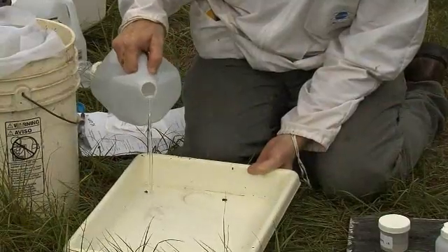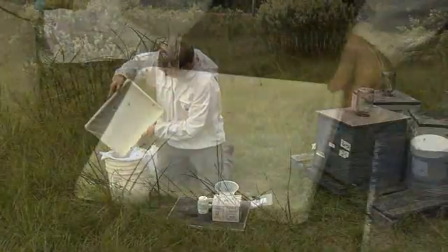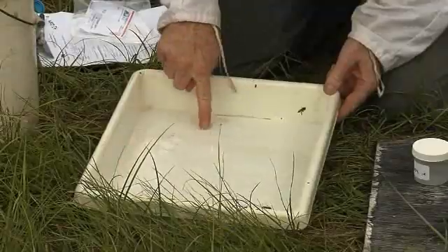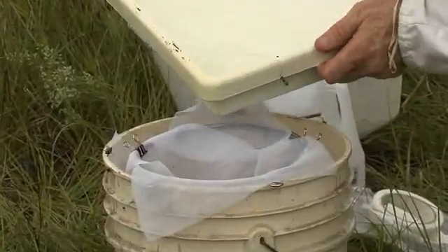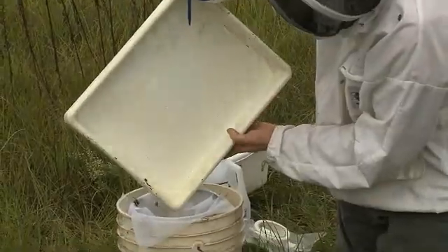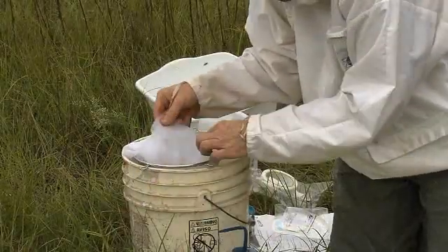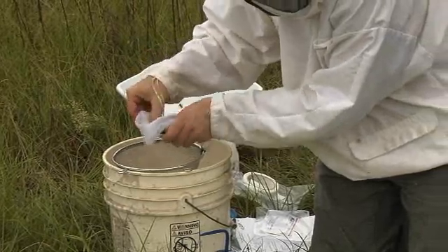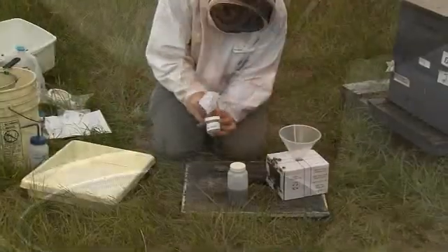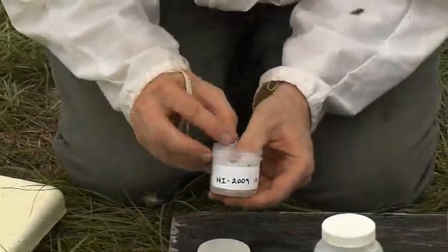Place about two cups of water into the collection pan and gently swirl the contents before pouring the water and debris through the nylon filter. Pour another two cups of water into the collection pan to remove any remaining debris. If necessary, use your finger to gently dislodge anything stuck to the bottom of the pan and pour the contents through the filter. Use the wash bottle to remove any remaining debris and pass it through the nylon filter. Now gently remove the nylon filter from the strainer, folding it so that the filter debris remains secure in the center. This debris will be examined for mites, specifically Tropilaelaps. Gently place the nylon filter into the small bottle containing alcohol and seal the bottle — be sure the filter debris is submerged in the alcohol.